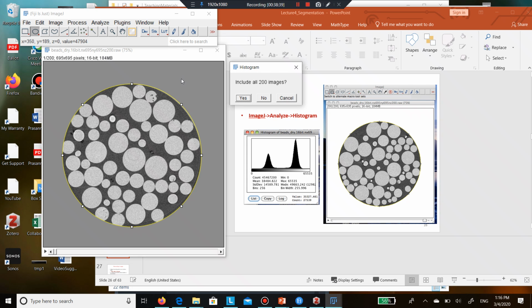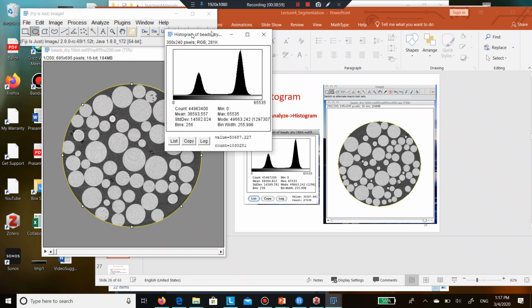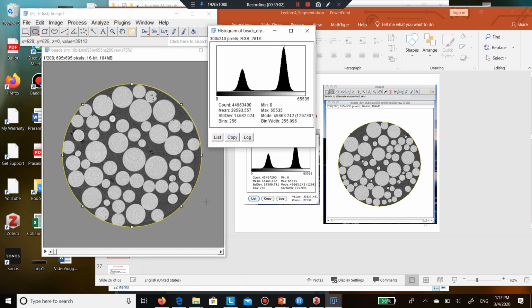So you can do math on it, take this constant value and set everything to a 0 or a minus whatever, some value that is way away from the spectrum you're interested in. But ImageJ will ignore this, so as long as we stay within ImageJ, all right.